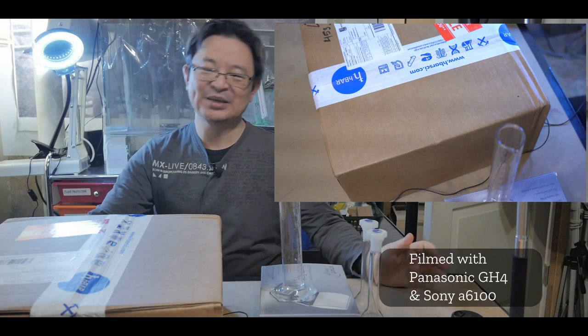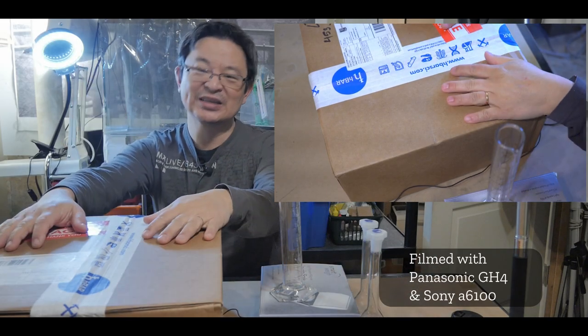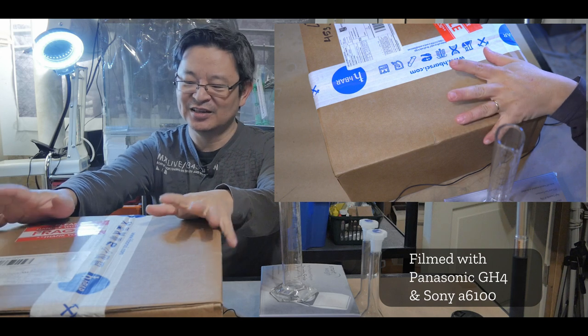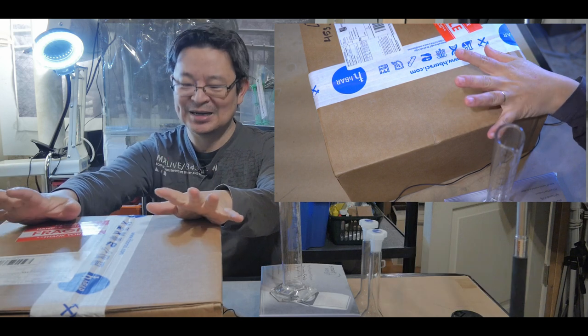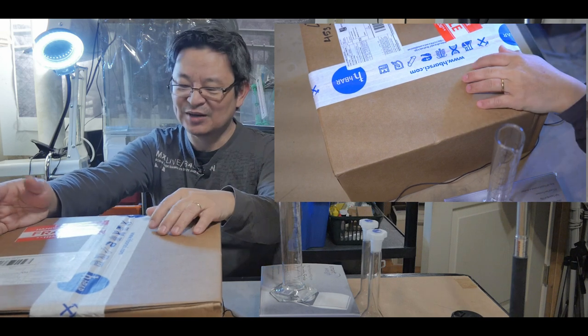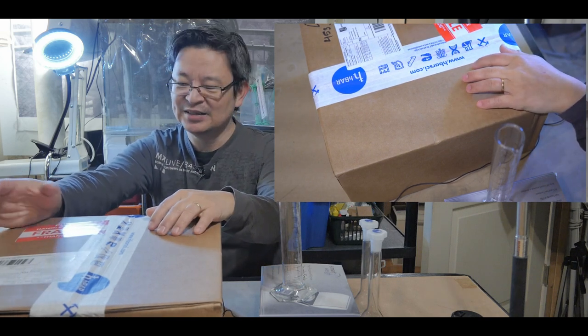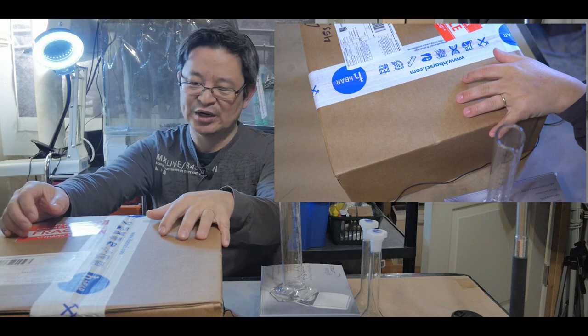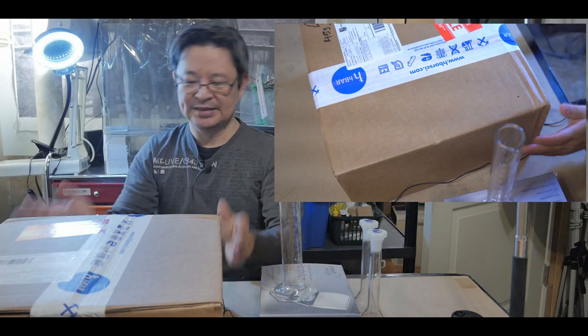Alright, so today I'll be opening my favorite glassware. I love labs, and one of the things I especially appreciate when doing labs from home due to our current circumstances is why I purchased a lot of this labware, or in this case, glassware.